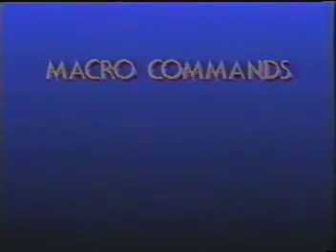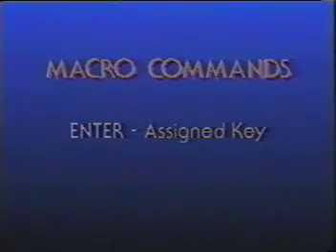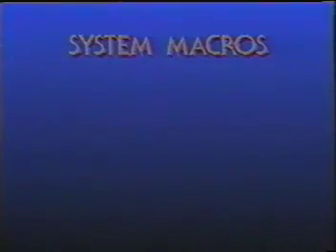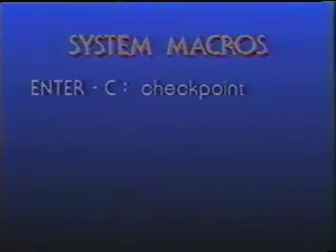In addition to these commands, there are several macro commands you must learn to run FACS Desk. A macro command is a chain of individual commands that are linked together and assigned to a key on the main keyboard. To call up a macro, you press Enter, followed by the key to which the macro has been assigned. There are 4 system macros. Enter C, described a moment ago, is the checkpoint macro. When you checkpoint, the Secretary places a copy of your desk into the long-term memory storage of the computer. Any work that is not checkpointed could be lost in the event of a power failure.